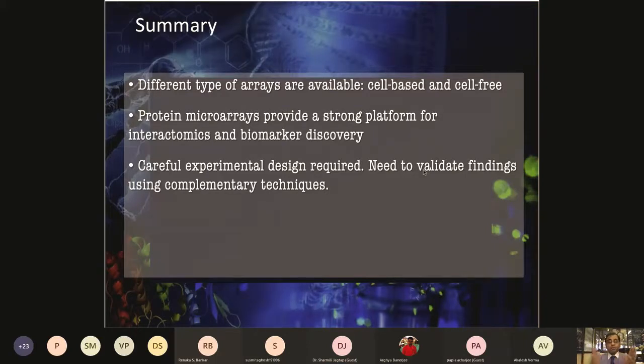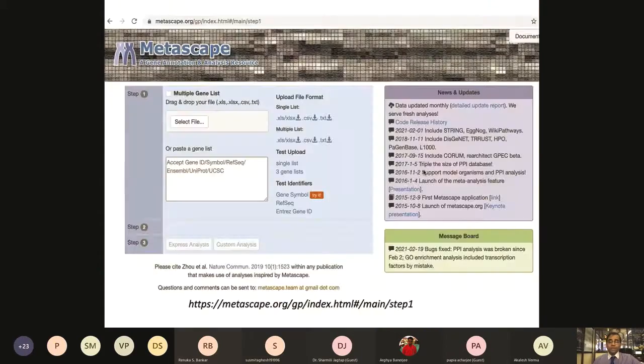So think about a biomarker discovery program, how that progresses from the really big exploratory experiments, narrowing it down, validating those, and then reaching the blinded state. Only if you have reached there, you can then either simply make an ELISA type of test from those, or make miniaturized chips which can be clinically applicable for testing. I think that's all for this brief lecture session on arrays.